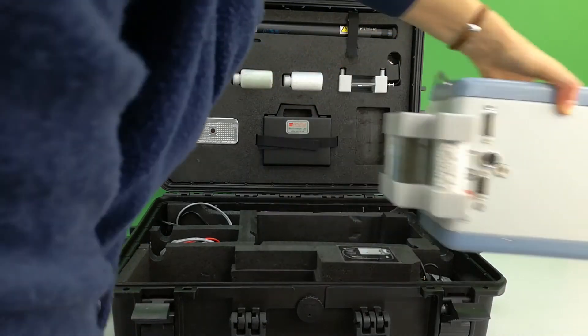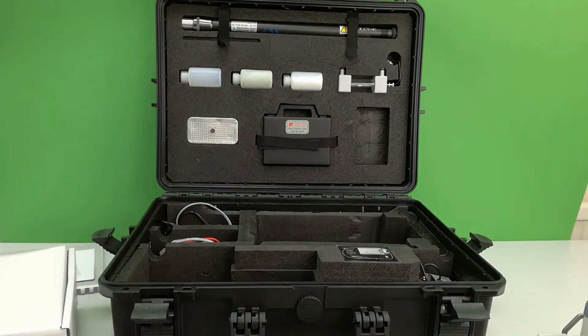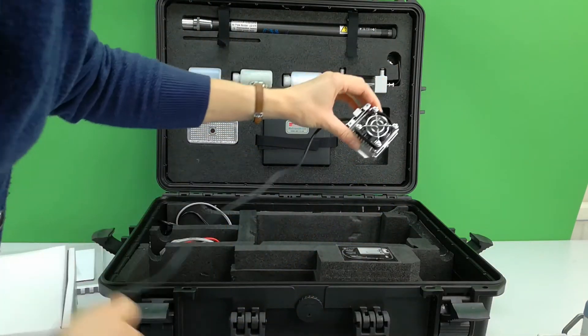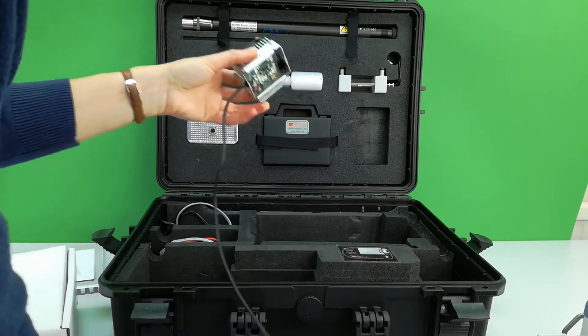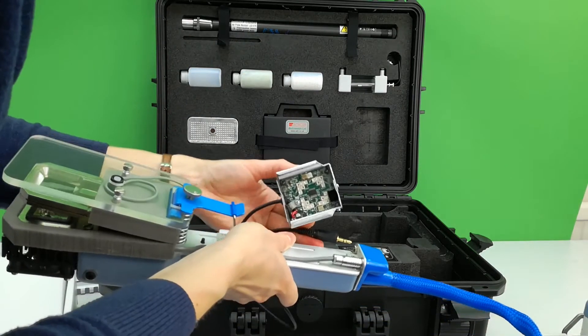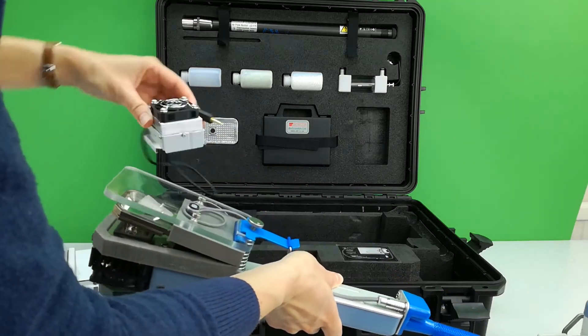The choice of two light units is given. One will be provided — either an RGB LED array or a white LED array. The unit slots into the handle and simply clips over the leaf chamber.